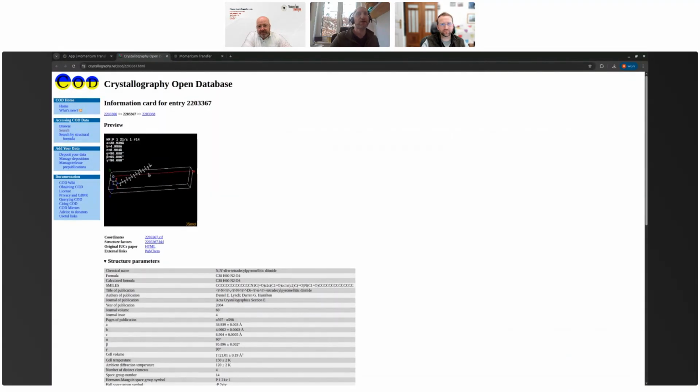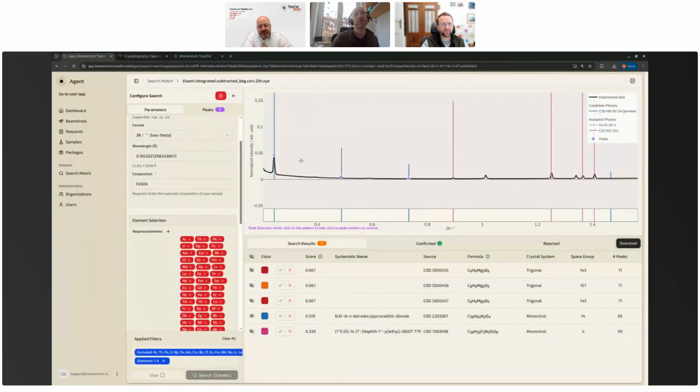I tell you right now, it's not the right thing, but it does have these long aliphatic carbon chains as spacers. And a common lubricant in these formulations, like sodium lauryl sulfate and things like that, also have a similar structure. So this doesn't give you the right phase. And I think that phase is unfortunately not in COD, but it at least gives you a way to test, you know, are there some structures that might describe that and what are the properties?